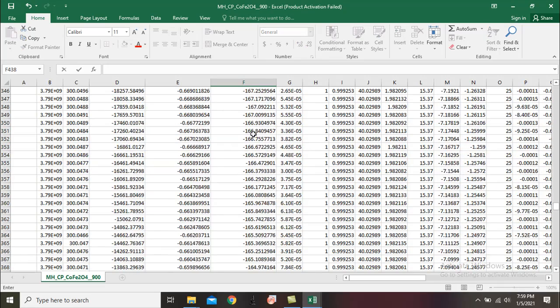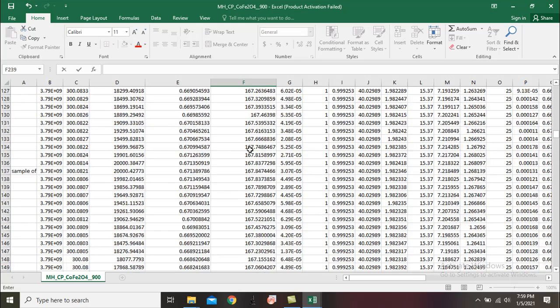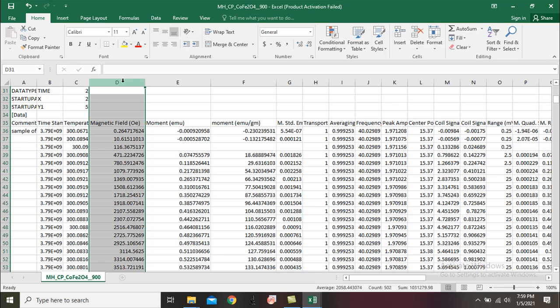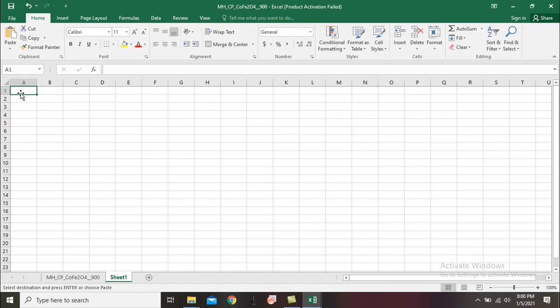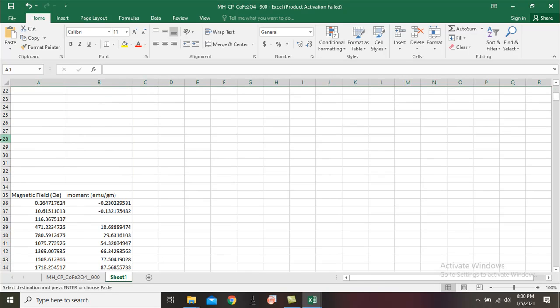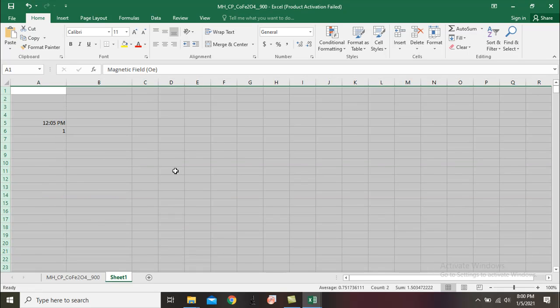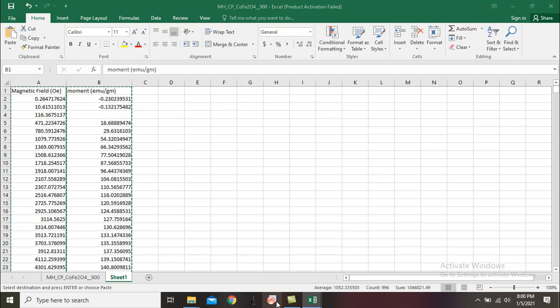I will keep those boxes empty for now. Now I will copy these two columns into another sheet, and then I will copy these two columns into Origin.